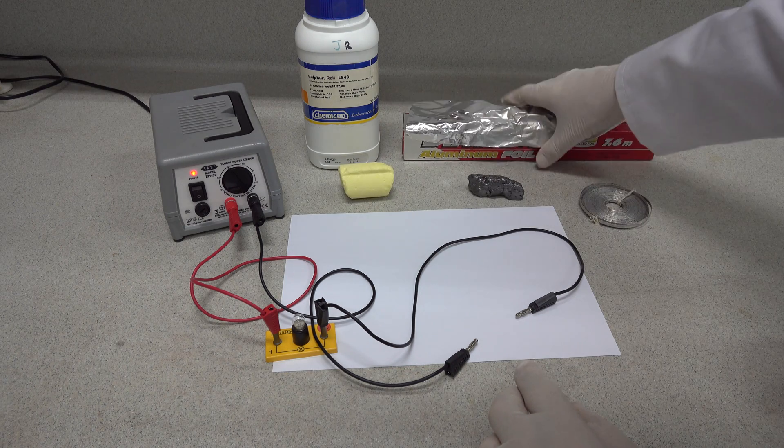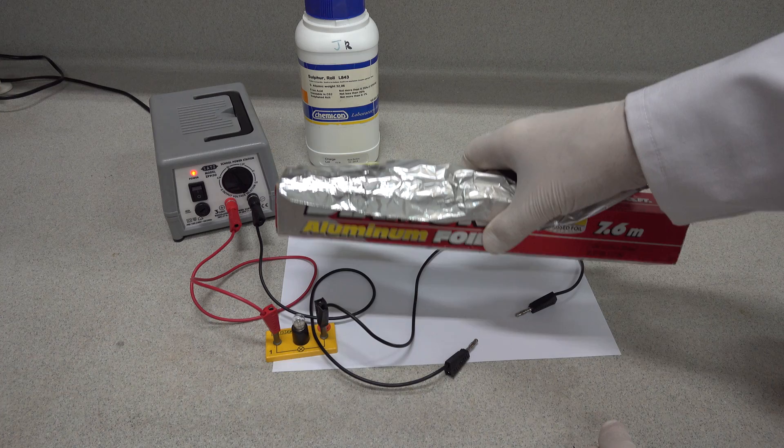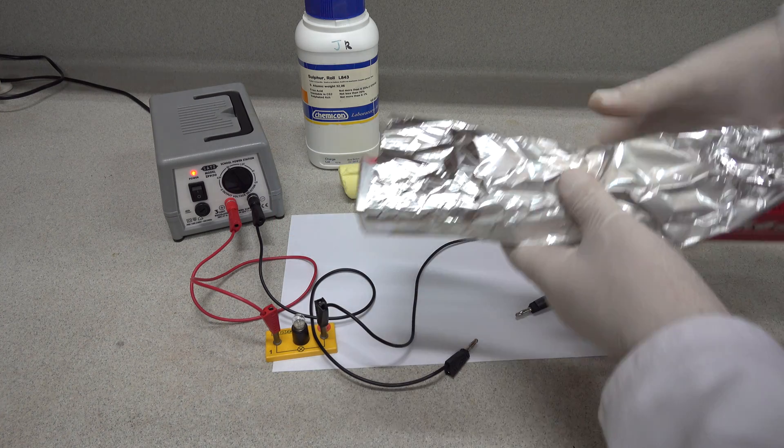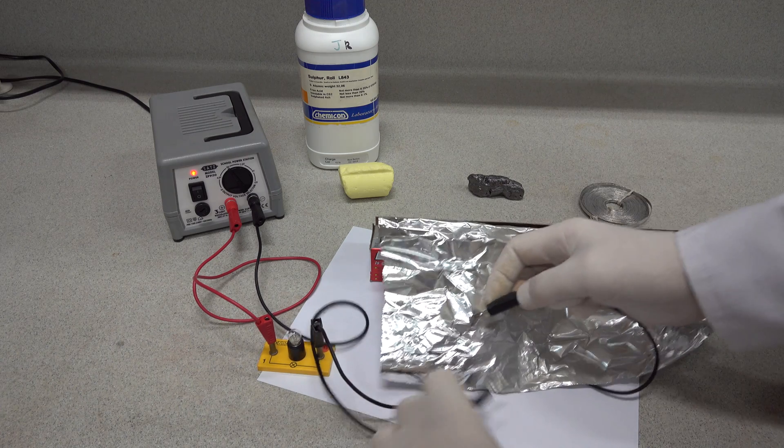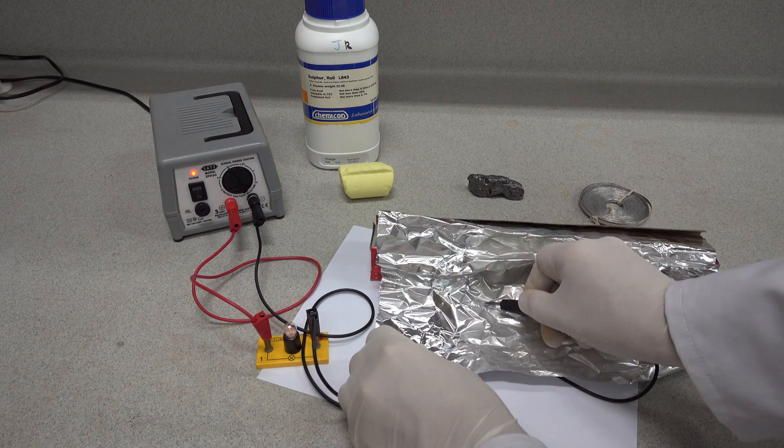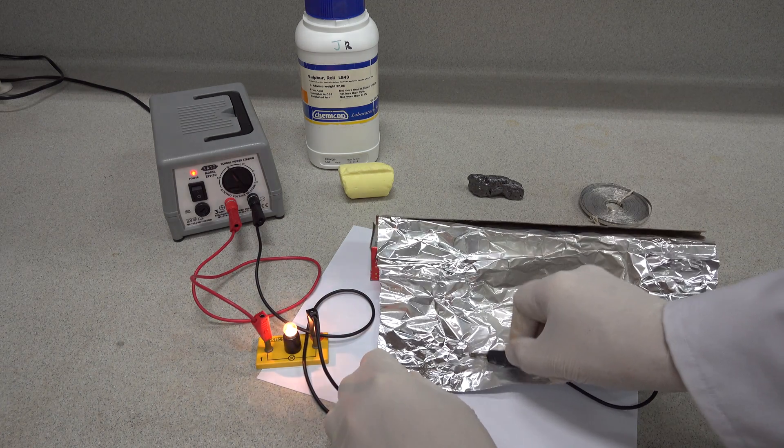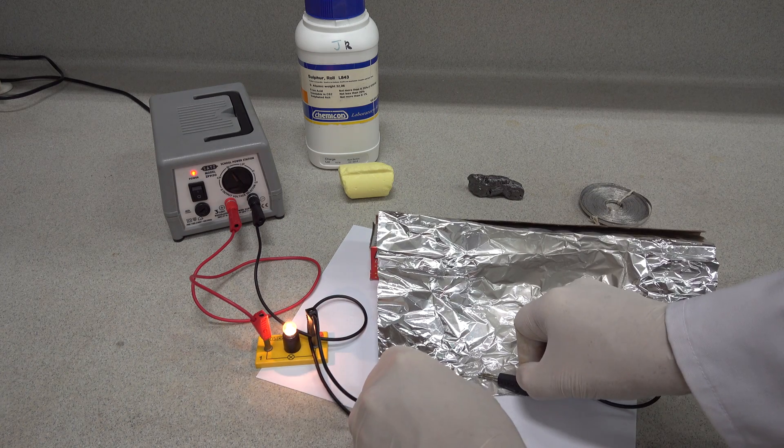Moving on to our second element, let's use some aluminium foil. If we place the electrodes on the aluminium foil, you can see that, yes, it conducts electricity rather well.